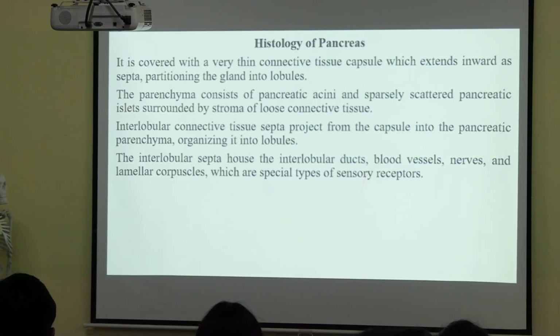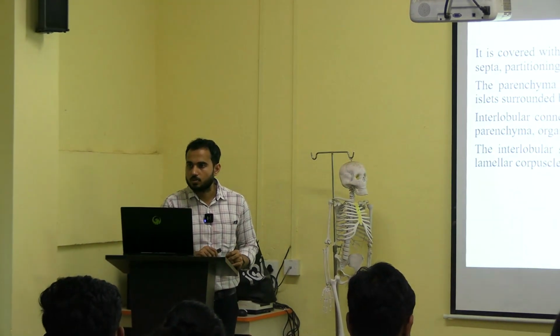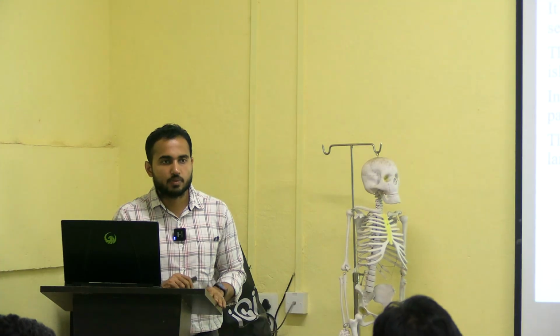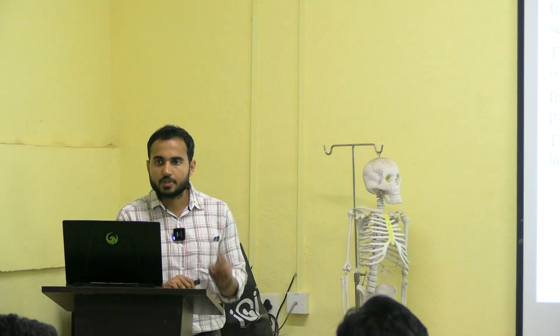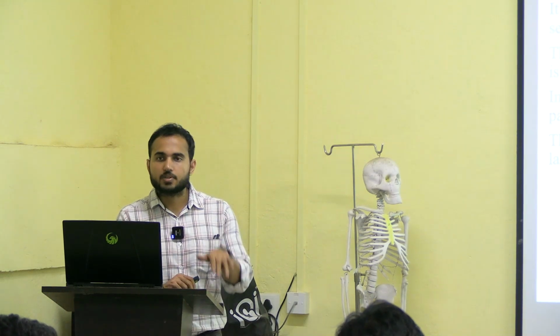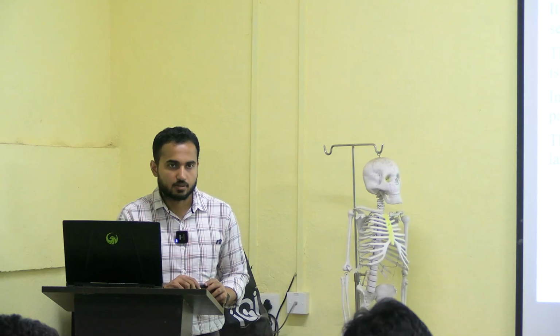Second point, same as the liver, pancreas is also covered by a connective tissue capsule. Septa extending into the substance of the gland will divide the gland into numerous lobules. So you have to take one particular lobule and study it.